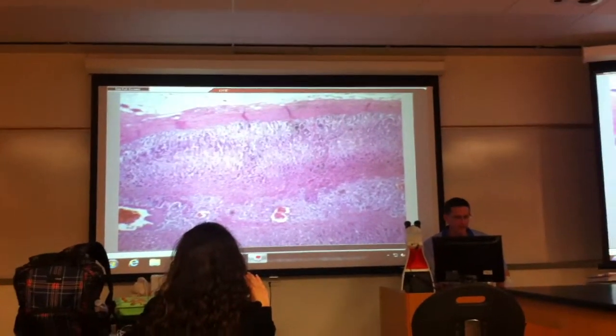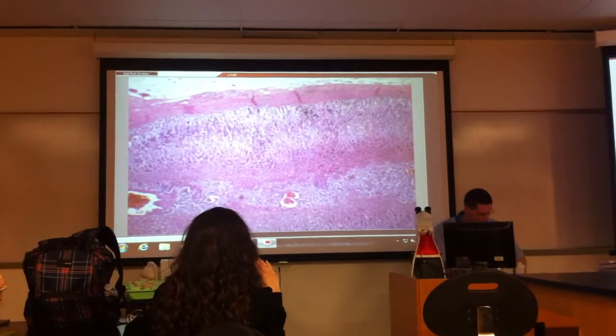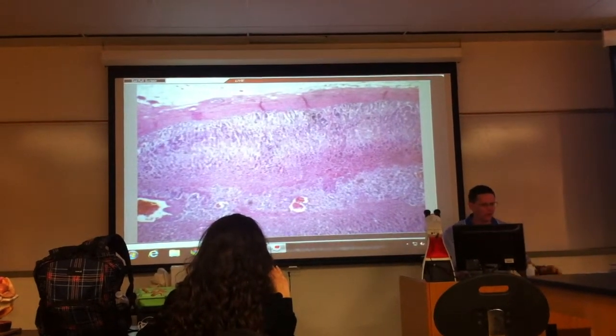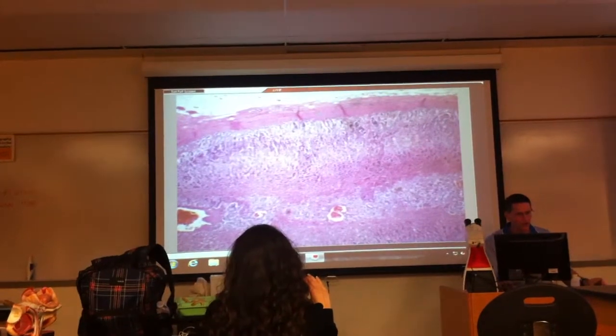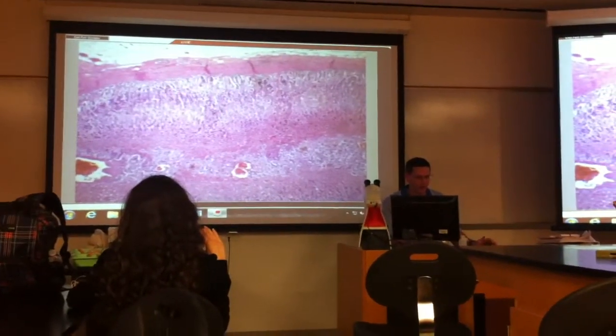So when you look at the adrenal gland, there are several stripes here, depending on how you cut it. All the way around the outside of everything, there's a capsule. So that is capsule, right? Looks basically the same as it does on testes or something else. So fairly thick capsule there.